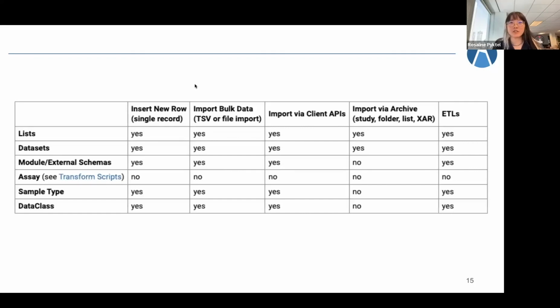Trigger scripts are written in JavaScript, and you can hook into functions that happen before insert/update/deletes, or after insert/update/deletes, or on initialization before any rows are processed, or on complete after all rows are processed. Because you can invoke arbitrary JavaScript and have access to a LabKey API within trigger scripts, they are pretty powerful. You can use them for custom field validation, or altering the incoming data in some way, or populating another column, or sending out emails, etc.